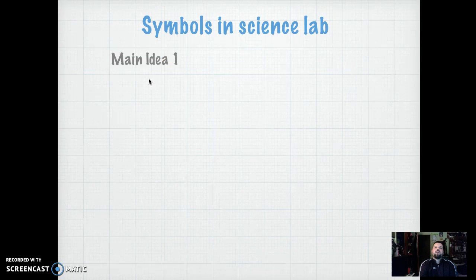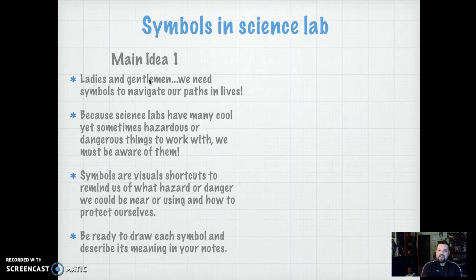So let's look at some symbols in the lab. Symbols make our lives easier to navigate. And since sometimes in the lab we have so many dangerous things to work with, we have to see the symbols so that we know what we're dealing with, what's hazardous. Our symbols are just a shortcut to teach us how to protect ourselves and what we're working with and dealing with.